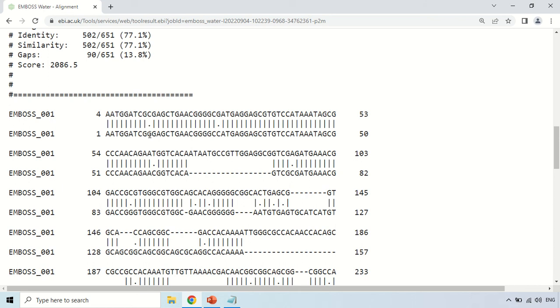You can notice there is a dot in this region. A dot represents a mismatch. Here you can clearly see that in the first sequence 'C' is there while in the second sequence 'G' is there. There is no similarity between C and G, so the vertical line is absent and the mismatch is represented by a dot.